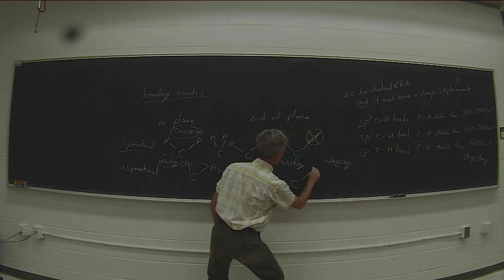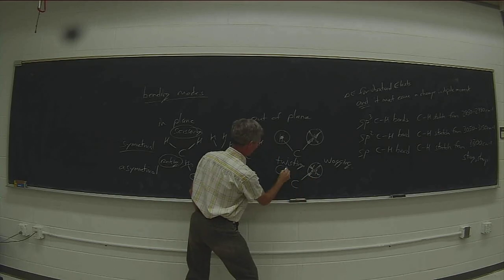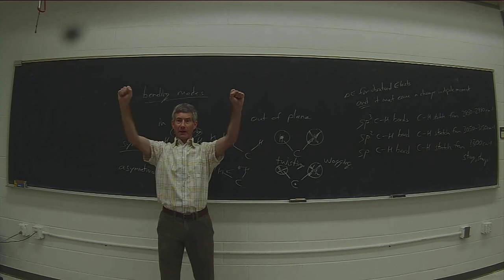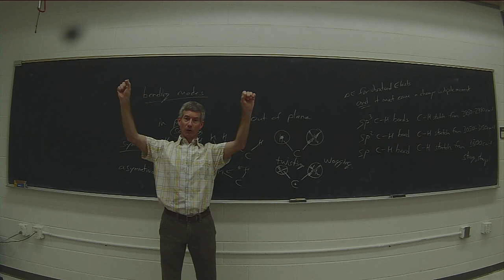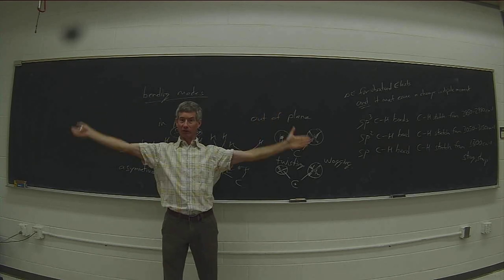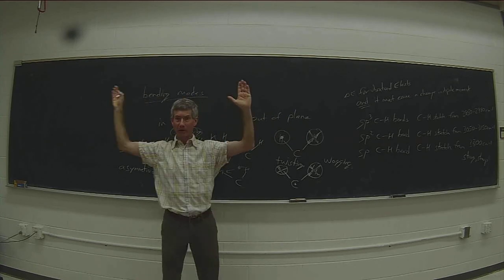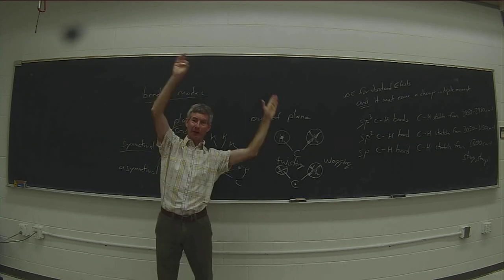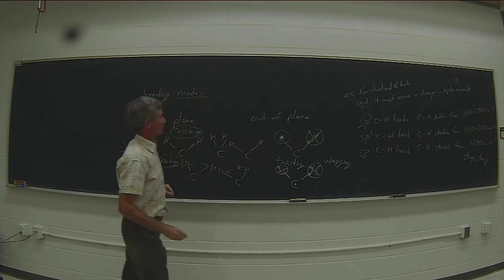where two hydrogens would go in and out respectively like this, whereas the carbon is moving back and forth in the opposite direction of the hydrogens. So we've got scissoring, which is symmetrical in plane. We've got twisting, which is symmetrical out of plane. We've got rocking, which is asymmetrical in plane. And then we've got wagging, which is asymmetrical out of plane.